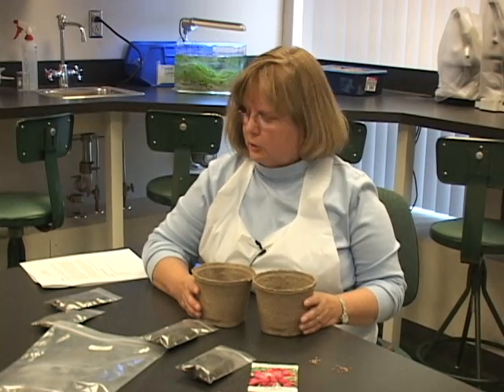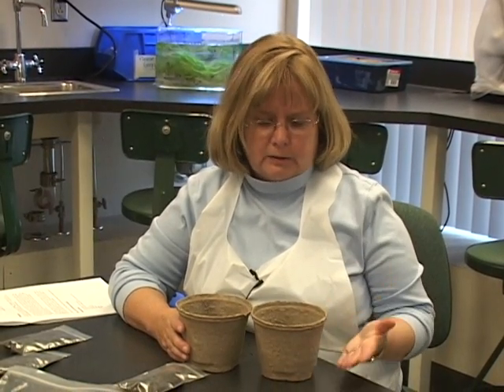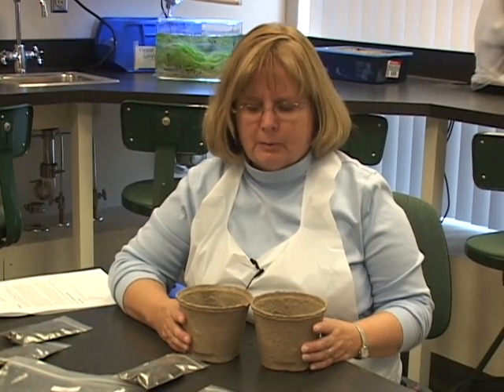Everyone, we're going to get started with doing the germination and growth in plants. In other words, this is the experiment to test what acid rain does to plants. Not only are we going to be looking at the effects of acid rain on plants, but also on germination. But the first thing you need to do is work on part 2.